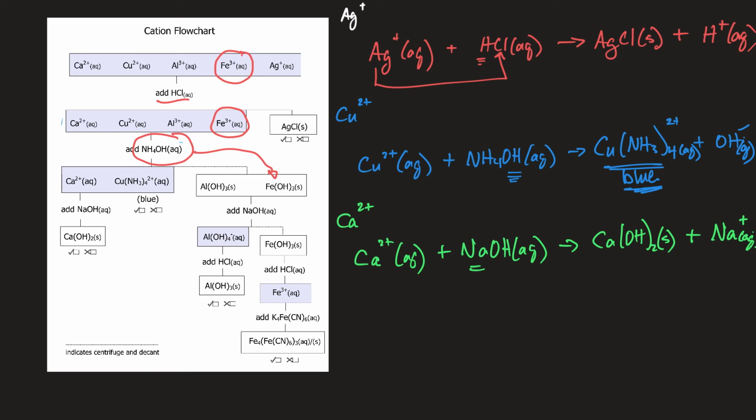Now that's probably the initial solid that forms. We did all these other steps here to confirm the presence of iron, but this initial one where you get that orangey kind of substance, I think I can use that for the reaction to indicate that you got some kind of precipitate.